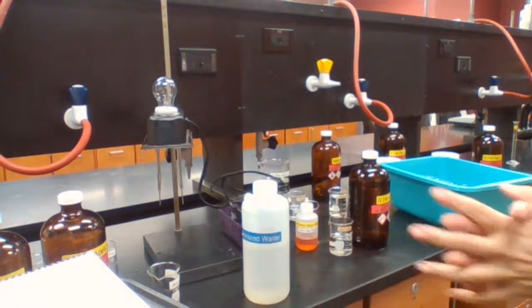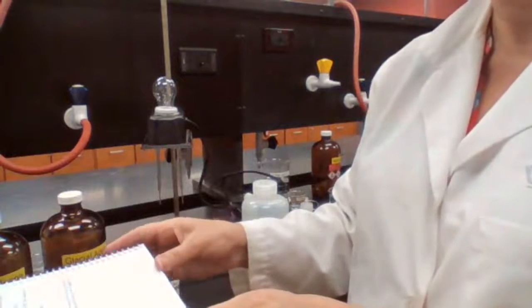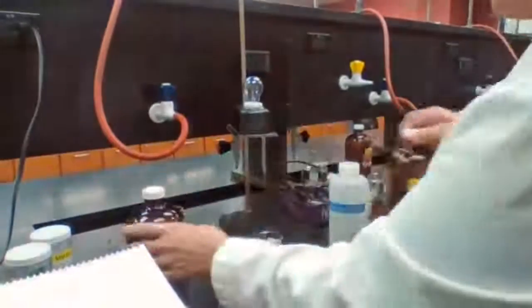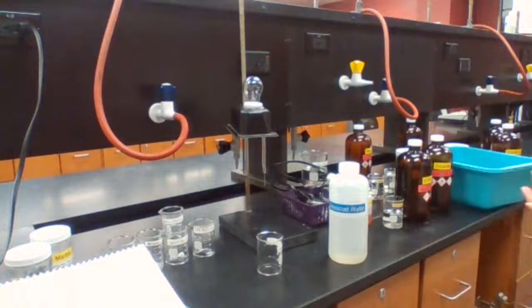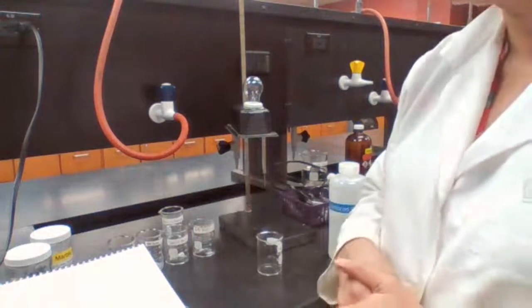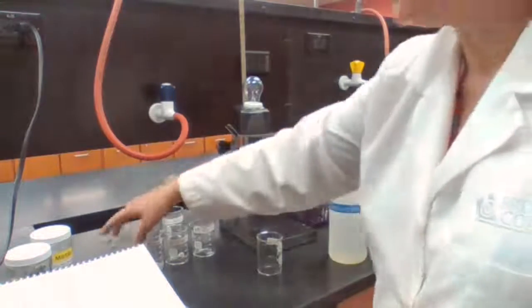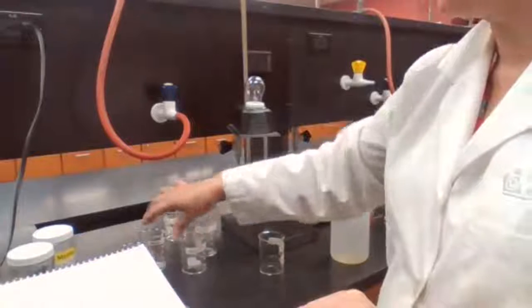So we studied the effect of the solvent already. Now, how do we know if an acid is a strong acid or a weak acid? You can memorize it. There are 6 acids that are strong acids. Everything else is a weak acid. But for today's experiment, we are going to try acetic acid and hydrochloric acid.